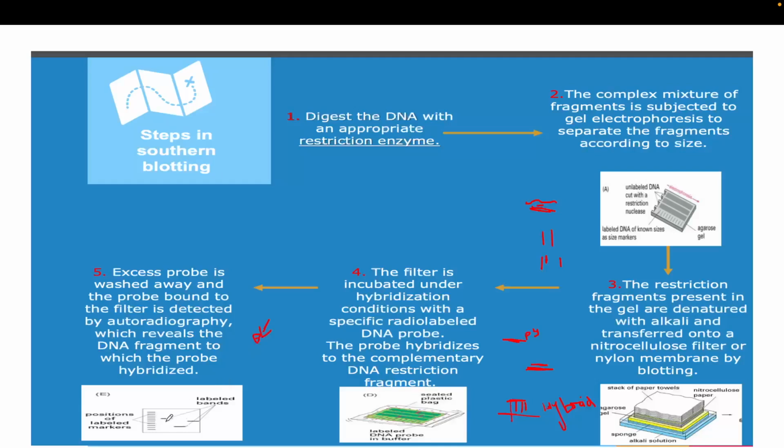And this signal will show you where the result bands of your DNA sequence are. This is the target band, you can say, which is labeled with the radioactive molecule. So this is the complete procedure of the southern blotting.